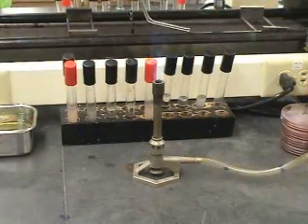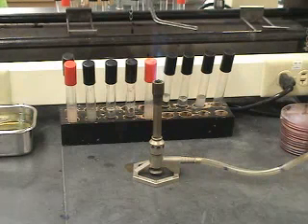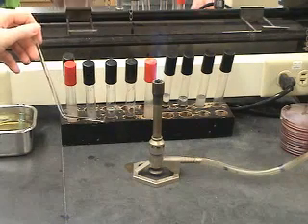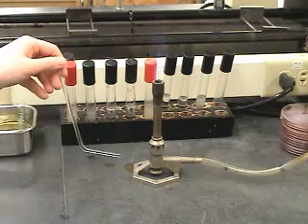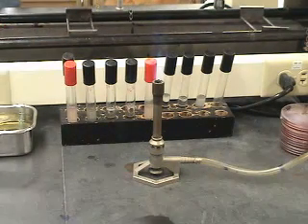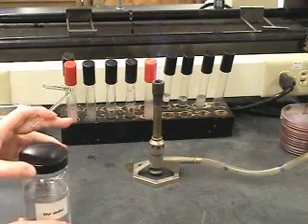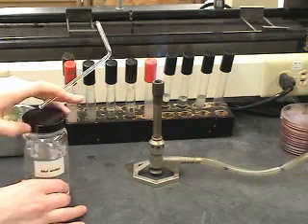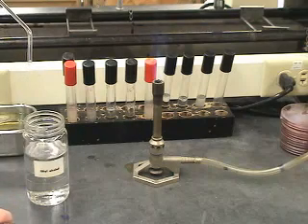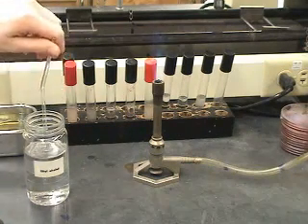Once volumes are distributed to plates, they must be spread across the agar surface. This is conveniently done with a glass rod. The glass rod is sterilized by passing it through a flame. It is then dipped in ethanol and flamed again to complete the sterilization process. After sterilization, the glass rod is allowed to cool a full 20 or 30 seconds before being used. Insufficient cooling may result in the destruction of microbes during the spreading process, and inaccurate results.